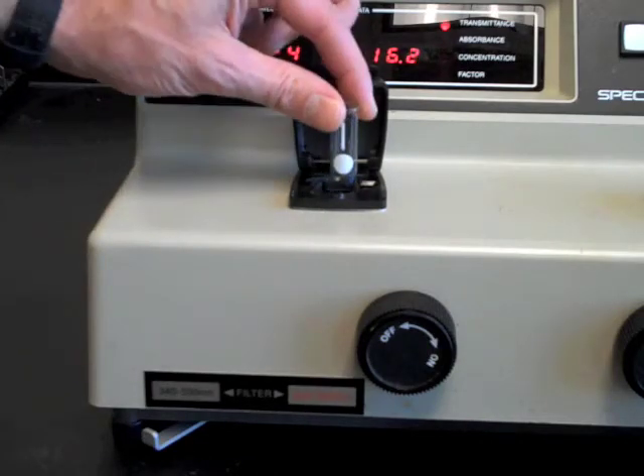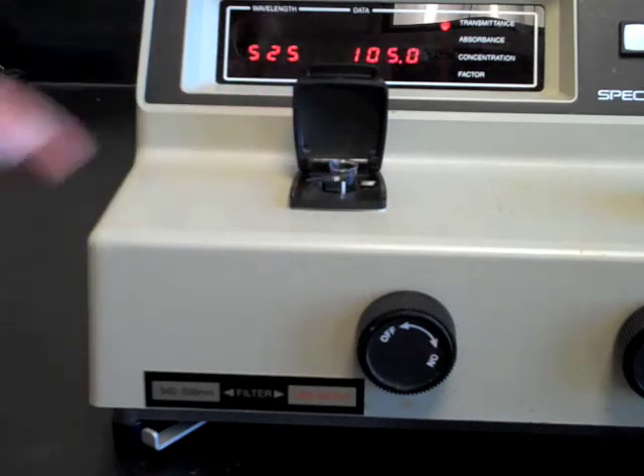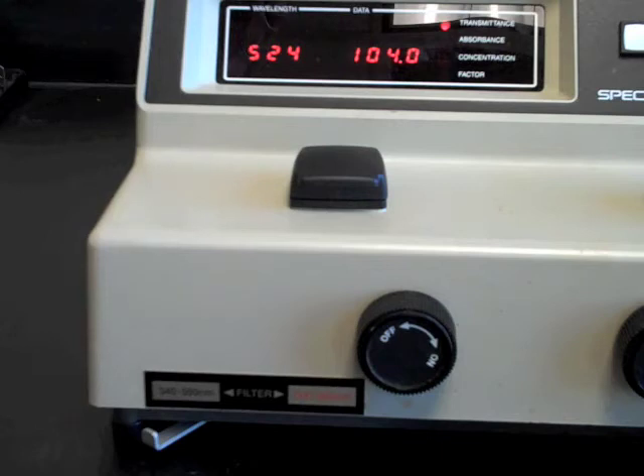Notice that the cuvette has a vertical line painted on it, which helps you align it in the instrument the same way every time. With the instrument in the transmittance mode, set the display to 100% using the knob on the front right.